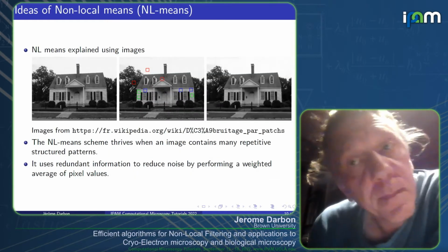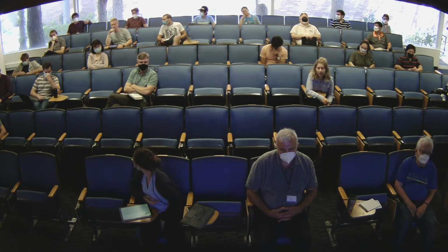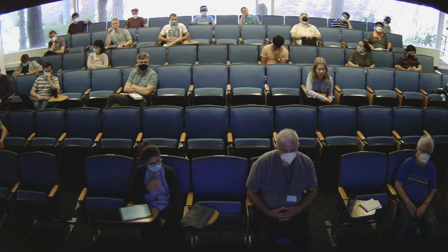Yes. So in that context, let's say you were to apply that to bioimaging. Imagine, for instance, looking at a fingerprint where there are lots of very redundant patterns but rare artifacts. Would that technique tend to erase artifacts and replace them with redundant patterns, or is this technique specifically preserving artifacts in the context of nearly identical patterns around them? Now, what's going to happen if you do not find similar patches is that essentially you're not going to modify the image a lot. So you're going to preserve the noise.